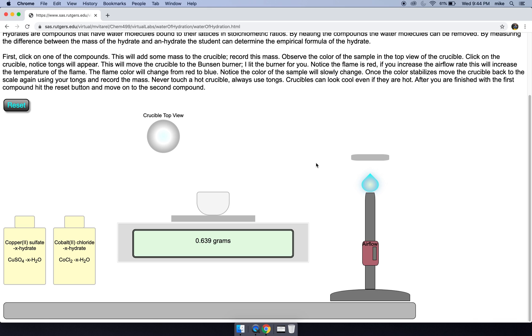Let's just check real quick. 0.639 grams. Let's move it back one more time and let's just see if it changes.